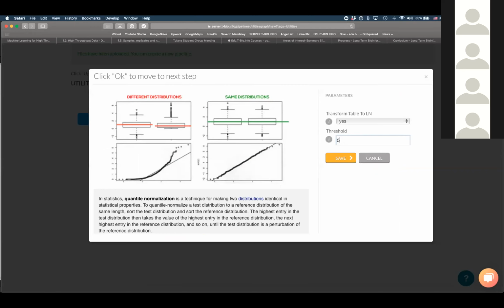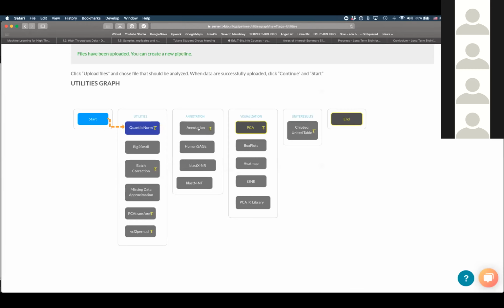And when you work through a lot of these next generation sequencing data sets, what you will find is that a lot of the expression data fits this threshold. And you can study it more by looking at summary statistics and seeing the distribution of your data, that the signal is underneath this threshold of 5 in logarithmic scale. So now we adjusted our raw data.